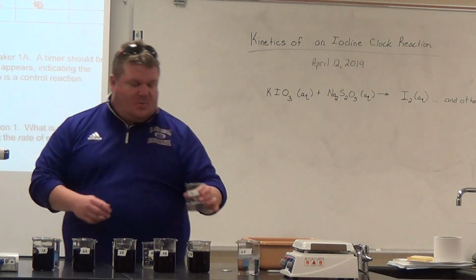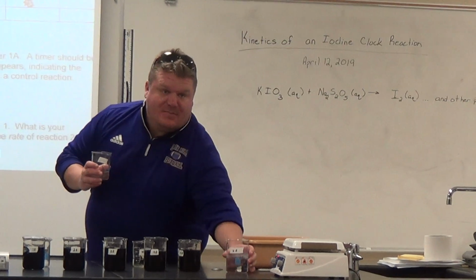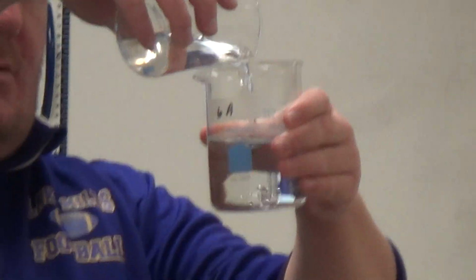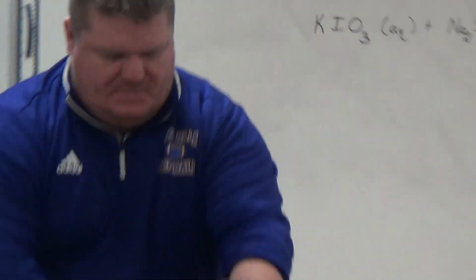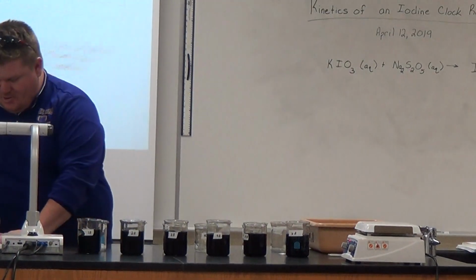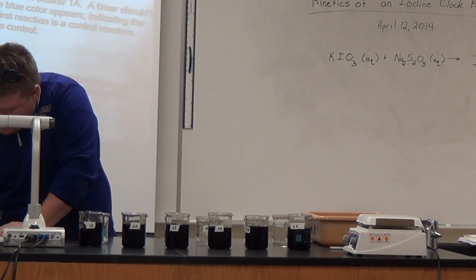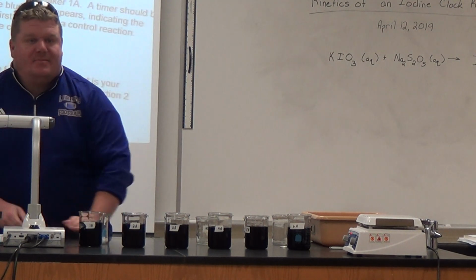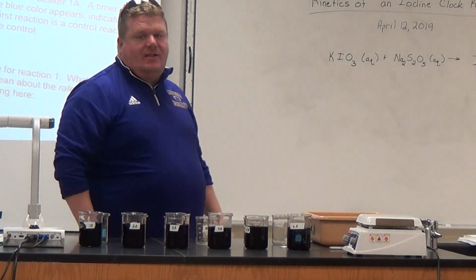All right. So last one. You ready, Mr. Manis? Yep. Okay. Here we go. Whoa, wow. The result is 2.5 seconds. And that, ladies and gentlemen, concludes the demonstration on iodine clock kinetics.